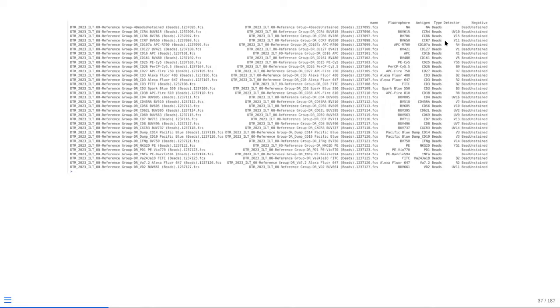So you can see the guess has come up with a result for most of these across the board, except for the two problem children that didn't have a space for this particular screenshot, which are showing up empty at this stage. So if you are one of those instruments that is covered, this is one way of being able to provide information about which detector you want to build that x-axis gate for a corresponding fluorophore. But there's still a couple that you would need to edit in, either by writing this out as a CSV file or alternatively doing the mutate case_when conjunction to be able to do so.